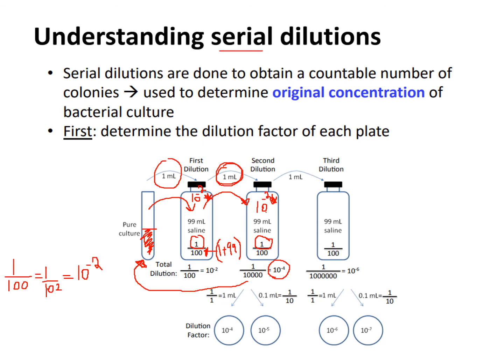Meaning, so far, how many times did you dilute your original sample? You've so far diluted it twice. Okay, so right here, I've diluted it once, right, you guys? And I've diluted it a second time. Okay, each time so far I've diluted it 10 to the power of 2. So right here, I've diluted it 10 to the 2, and here 10 to the 2. Okay. You can, by the way, say 10 to the 2 or 10 to the negative 2, so it's fine.